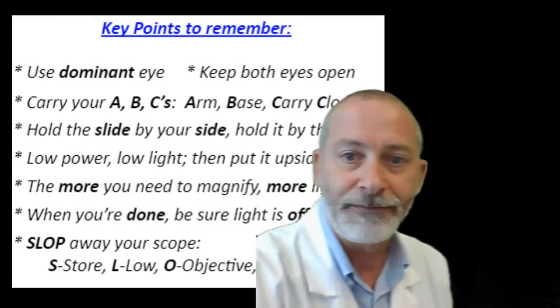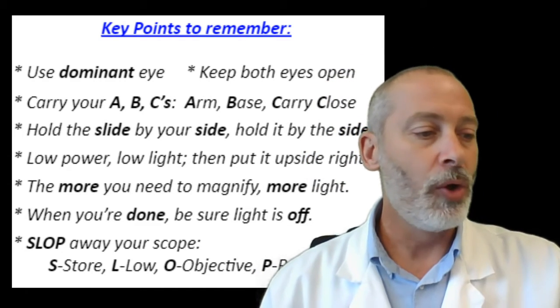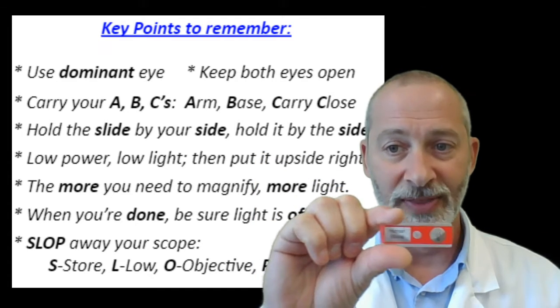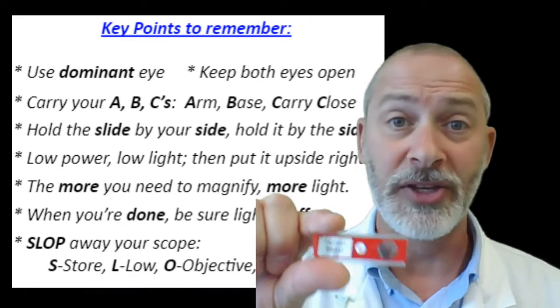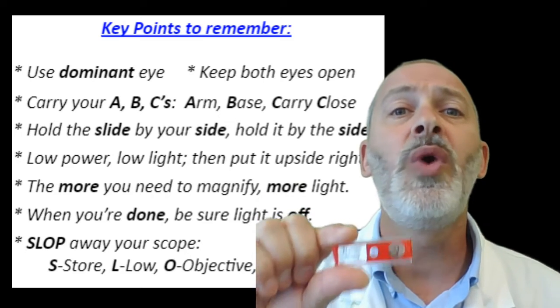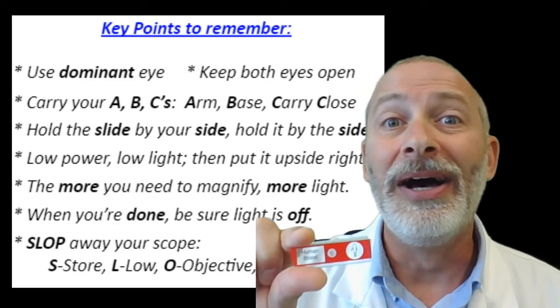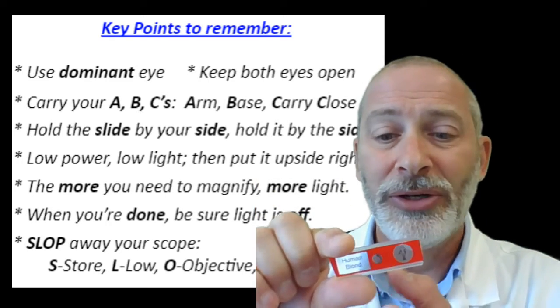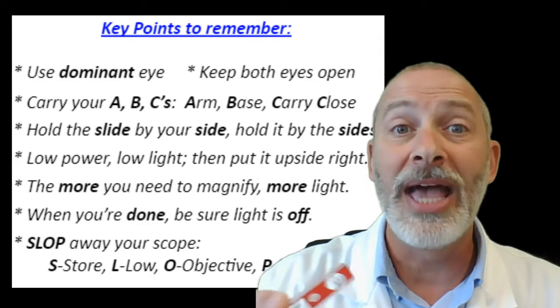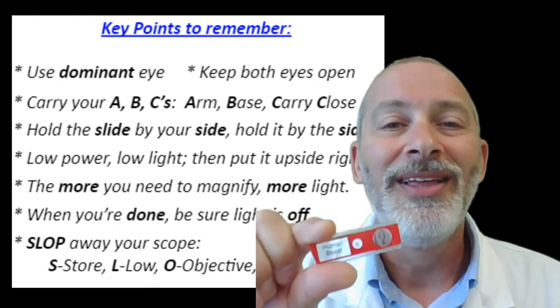All right. Next, holding a slide. Slides have specimens on them, or they will have a specimen on them if you are making a slide. In either case, you want to be looking at the specimen and not your grubby little finger oil, all right? Your little fingerprints, although the fingerprints are kind of cool to look at. But if the assignment is to look at a specimen of some other kind, you don't want to smudge the slide.